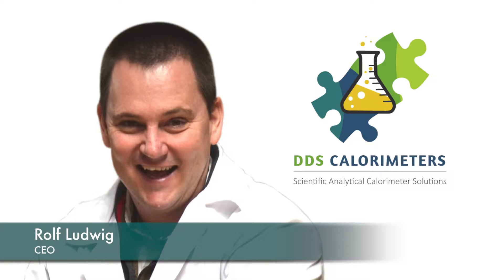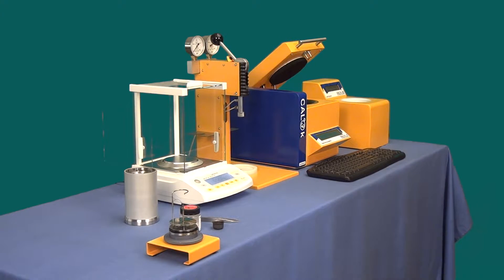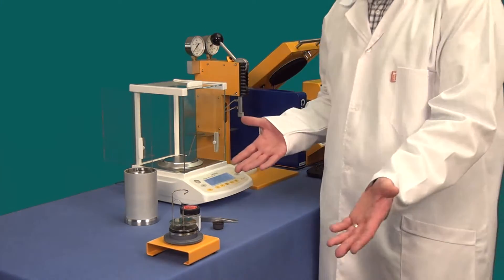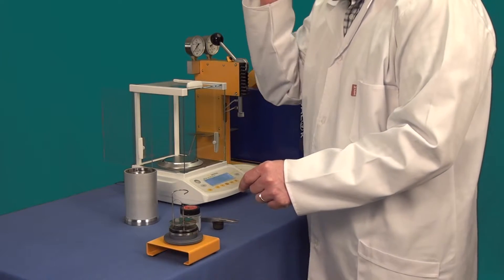Hi, I'm Rolf Ludwig. We at DDS are the manufacturers of the new CAL3KA calorimeter. Let me show you how easy it is to run a simple calorific value or CV determination. Let's begin.